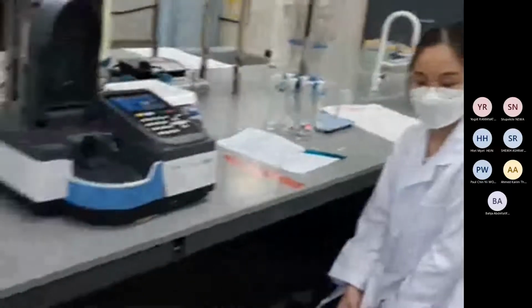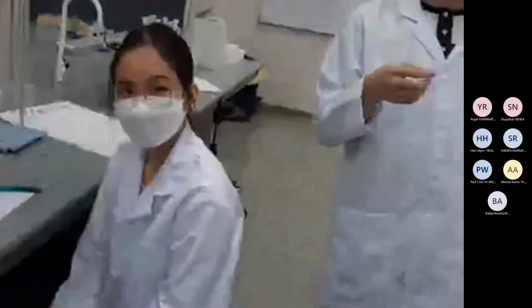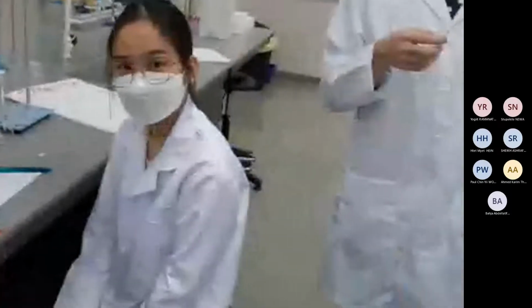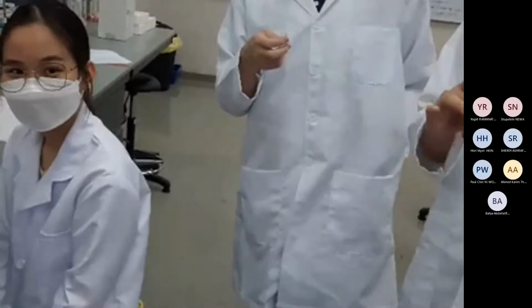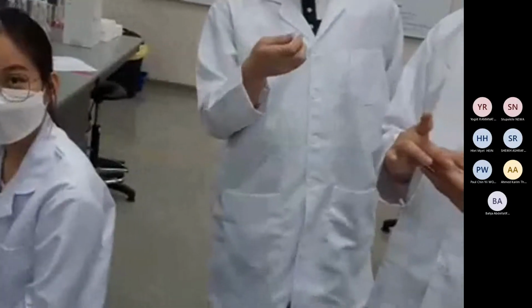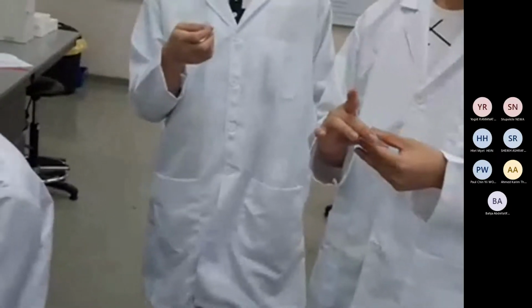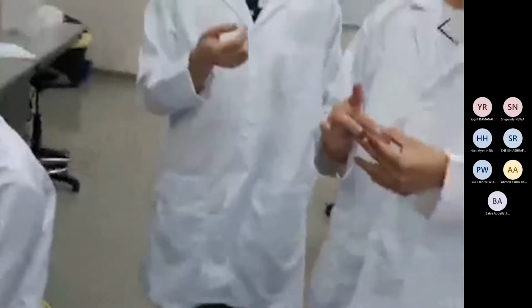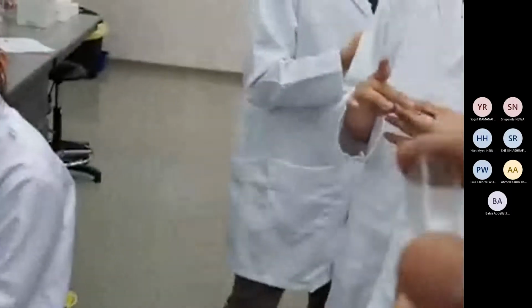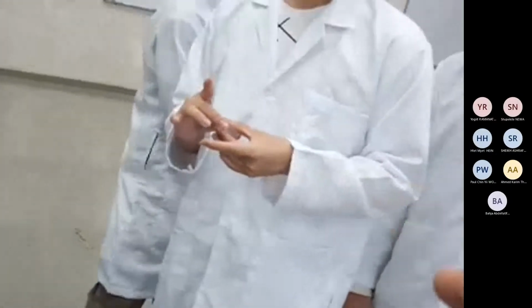Sorry, it will not break. Don't panic. I broke a quartz one when I was working on my research. It was very expensive at that time, and I was so shy. Anyway, my supervisor was very good, he paid for it. That time we used to have quartz. We had this one, but for my research I needed a different one. This has some degree of transparency problem. Quartz doesn't have.